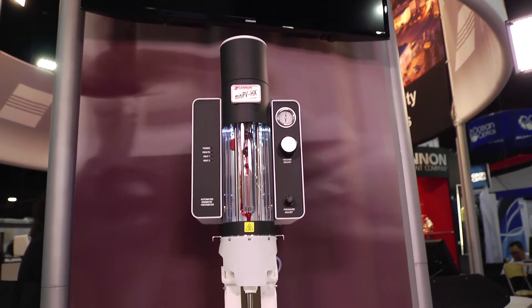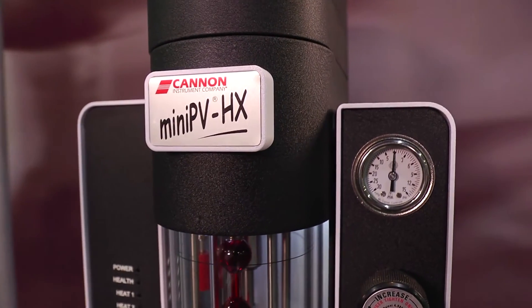You're able to link up to four systems to one computer using our powerful VISPRO software, which will allow you to test multiple temperatures, viscosity ranges, and methods, and use different solvents all consecutively.